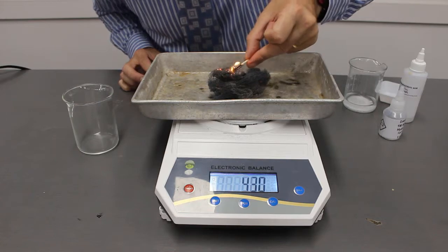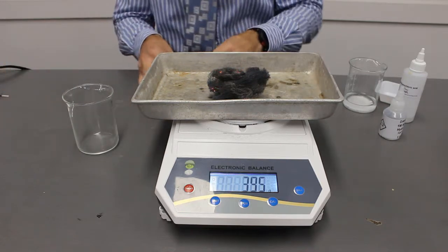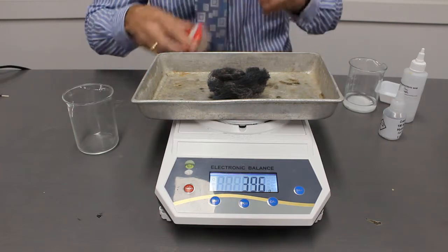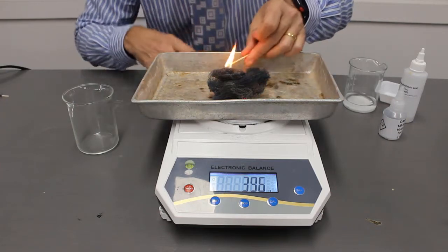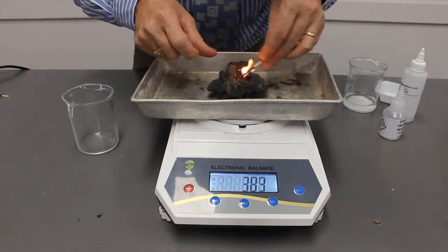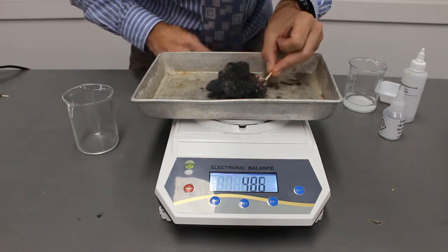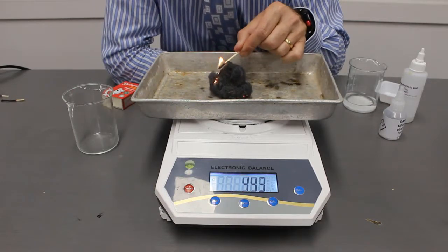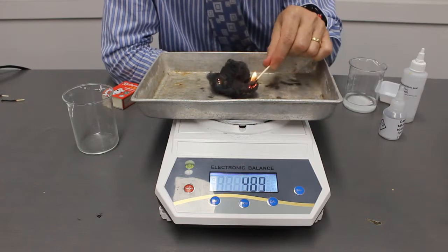I don't know if you can see, but it's actually turning a blue color. So the iron is actually changing color to a blue color. While we're doing this, I want you to make a prediction. What do you think is going to happen to the mass?